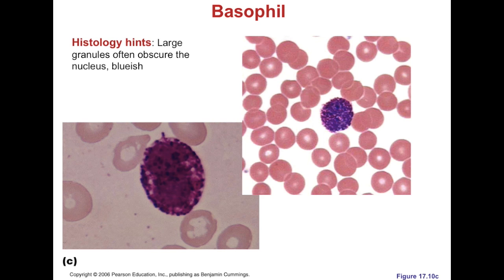They're pretty small, with tons of granules, and their distinguishing feature has nothing to do with the lobes of the nucleus, because you can't even see them. Their distinguishing feature is that you can't see cytoplasm, you can't see nuclei, they're just a sack of granules basically. And they're very, very coarse granules, so you can almost pick out where one granule is and where another one is, and they really do stand out. But it's going to be hard for you to find them. And they're almost always a very deep blue color too.